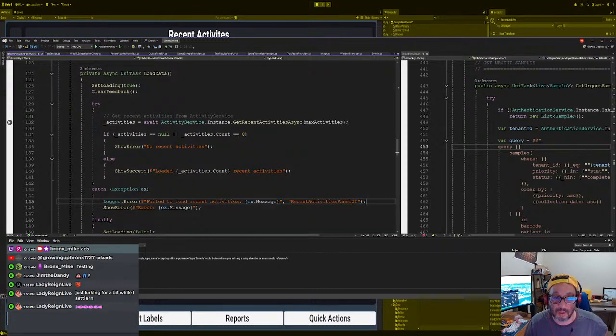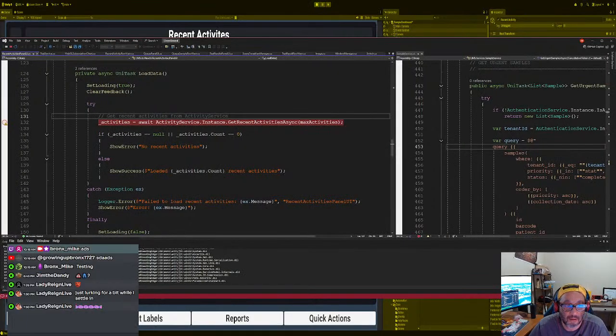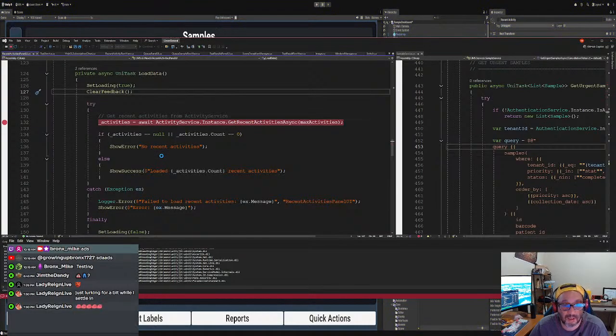All right, so what we're gonna do, we're gonna put a stopper right here, press attach to Unity, and then we could try to figure out what's going on. We debug it, okay? All right, wait until it's working. So sorry, you don't see the indicator, but I do. All right, so we do this again. Come on, you could do it. Hopefully it didn't crash. Yeah, it crashed. Let me stop it and try it again.